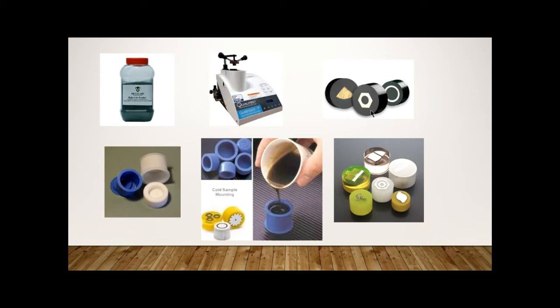The first one is the Bakelite powder in a hot mounting press. As the name suggests, we are going to give some temperature. During the temperature, the Bakelite powder will melt and bind together. You have to take the mold and check what is your size - one inch or half inch. Then you have to place your sample on the corresponding mold. After that, you fill the mold with Bakelite powder.